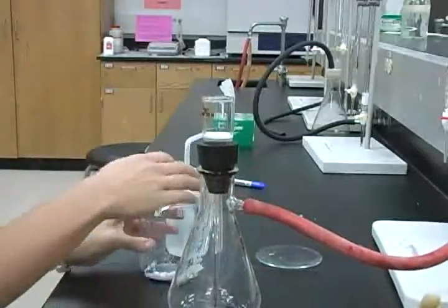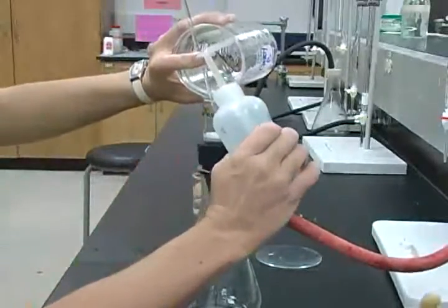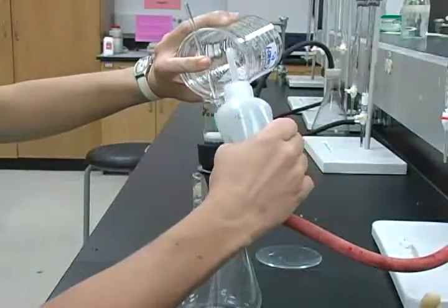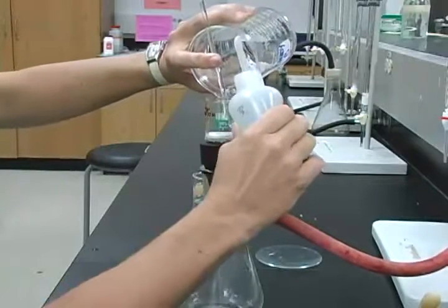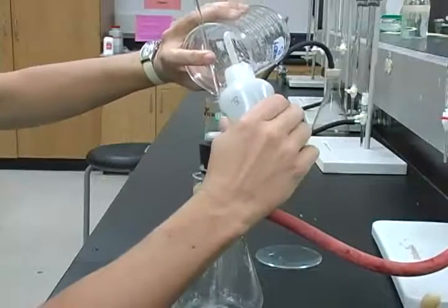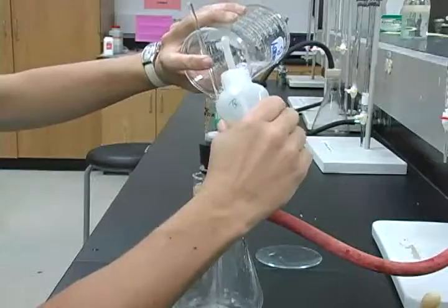To do this, you will continue to use your wash solution, using the wash solution to direct the solids down the walls of the beaker and into the crucible. Still try to avoid making direct contact with the wash solution on the surface of the solids.